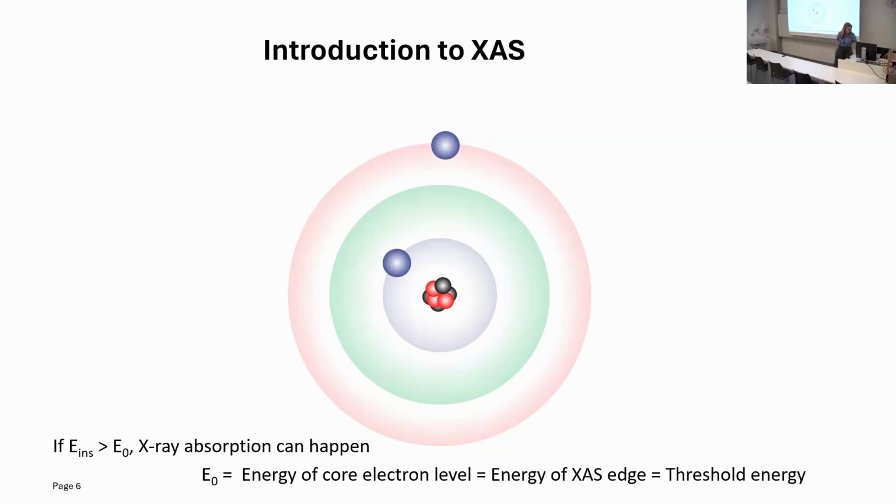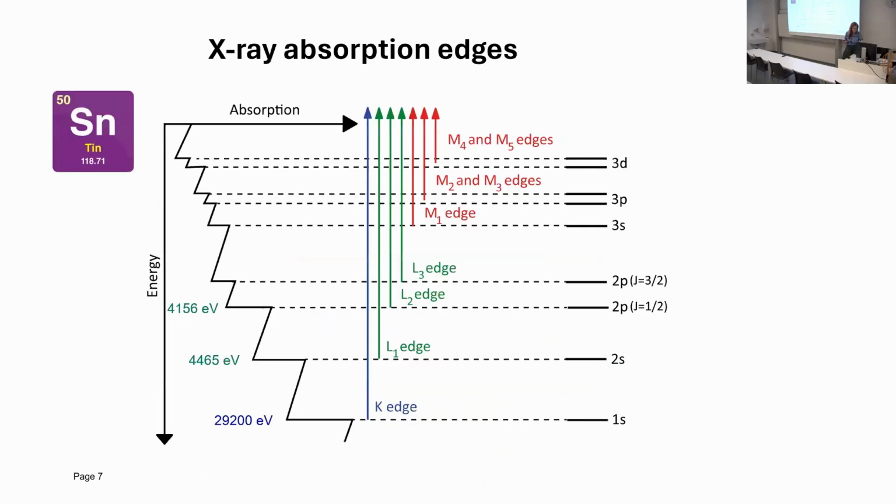And if the absorption process happens, the X-ray kicks an electron from its shell. Of course, very soon, in femtoseconds, this hole is being filled, but basically we can measure the probability of this absorption and detect not only the concentration of the element in the sample, but also assess its chemical state.